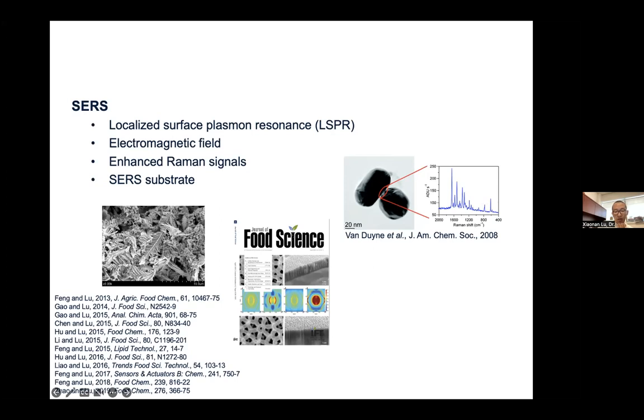Such as a leafy structure. You can see the leafy structure is between the nano and micro size. Once the analyte falls onto the surface of those leafy gold structures, a tremendously enhanced Raman signal will be received. This is another example. We designed a hollow structure on the basis of silver nanostructures. Once your bacteria or viruses or even chemicals fall into the hollow structure, there is a huge enhancement of the electromagnetic field within such a space. Therefore, the Raman scattering signals can be enhanced.